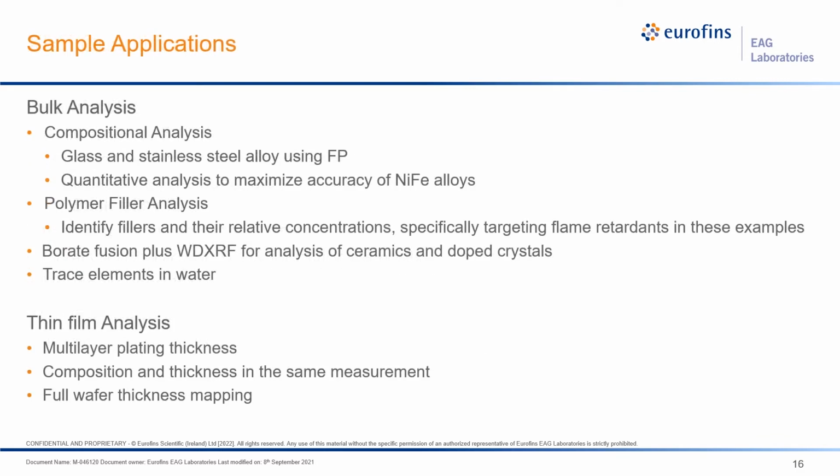Now we're going to look at some real-life examples that demonstrate the versatility of XRF for materials characterization. We'll start with some basic compositional analysis of different materials, including glass, metals, and polymers, including both standardless, semi-quantitative analysis and results calibrated against reference standards. Then we'll look at a couple of more specialized applications before turning to thin film analysis.